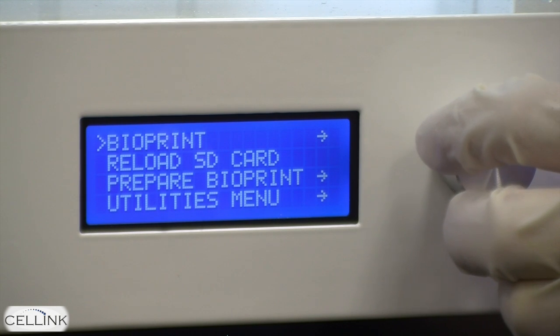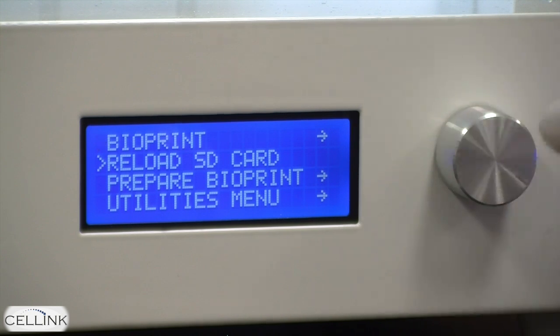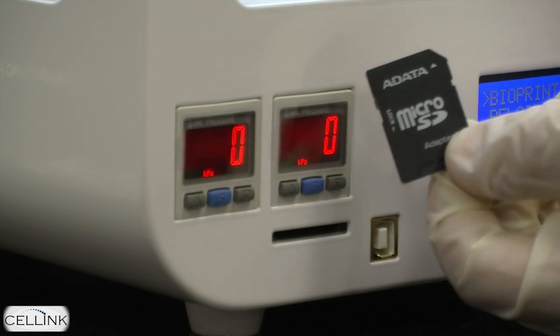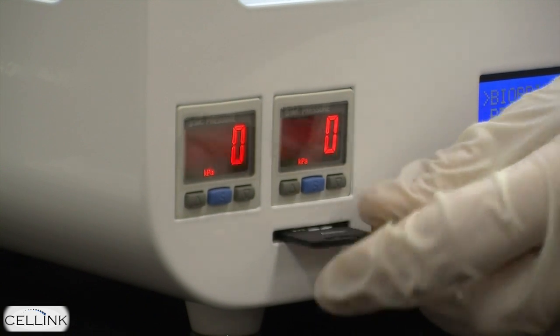The first one, bioprint, is what you're going to press when you're ready to begin bioprinting. Second is a setting that says reload SD card. You're going to use this setting whenever you add new files to the micro SD card and place the card into the bioprinter.